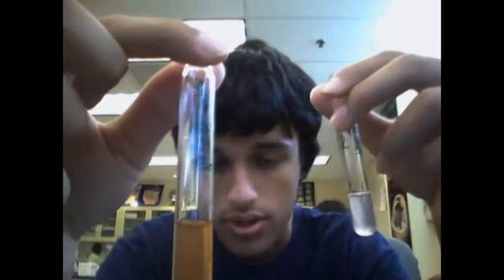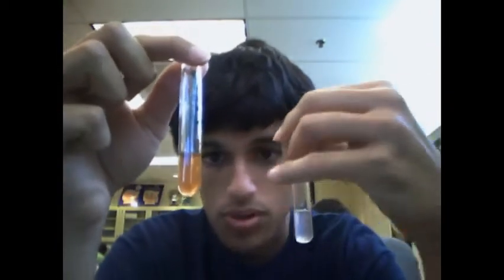This test tube number 1, as you remember, which produced the benzoquinone, is our positive control. So any reaction would have a color like this, maybe a little lighter shade if it's less of a reaction. And this is our negative control, the milliliter of water and milliliter of catechol, the one that is being incubated as we speak.